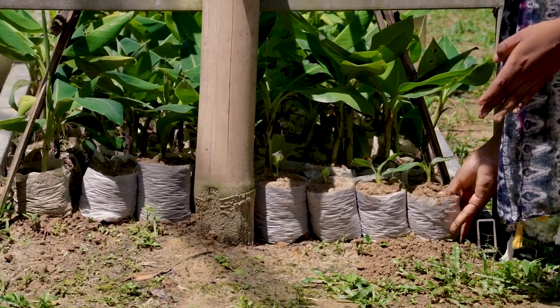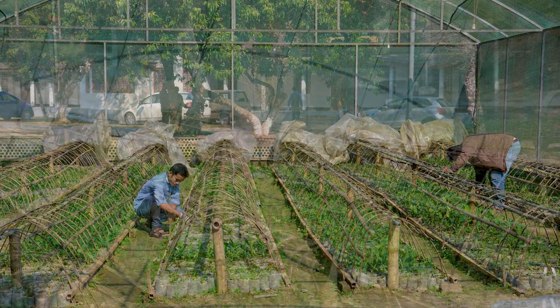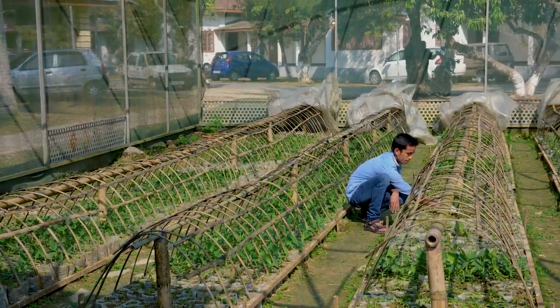Once the potting mixture is ready, we transfer the plants from the cocopeat tray into the potting mixture, and these are kept in the polytunnels. As you can see, this is our net house where we are keeping our micropropagated, hardened plants. Once the plants are properly hardened, they will be recommended for planting in the field, so that any growers or farmers who want to cultivate tissue culture plants can procure the plants from here and grow them.